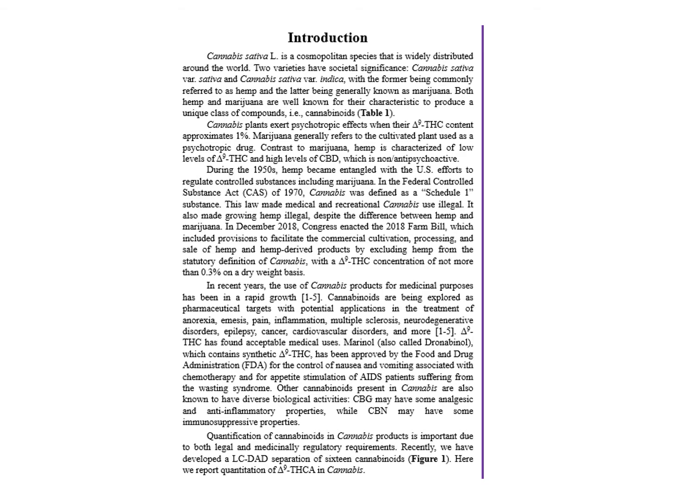Cannabis products for medical purposes have been in rapid growth. Cannabinoids are being explored as pharmaceutical targets with potential applications in the treatment of anorexia, pain, inflammation, multiple sclerosis, and other disorders. Delta-9 THC has found acceptable medical uses by the FDA to help with nausea and vomiting, especially associated with chemotherapy. So quantification of cannabinoids in cannabis products is important due to both legal and medically regulatory requirements. Recently, we have developed an LC-UV separation of 16 cannabinoids, and then I will get further into the analysis of that.